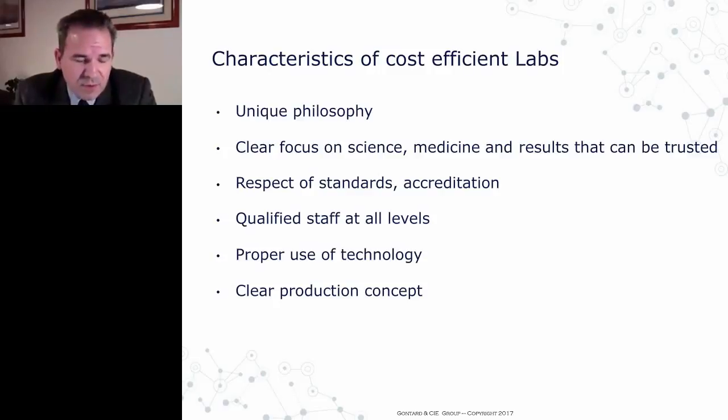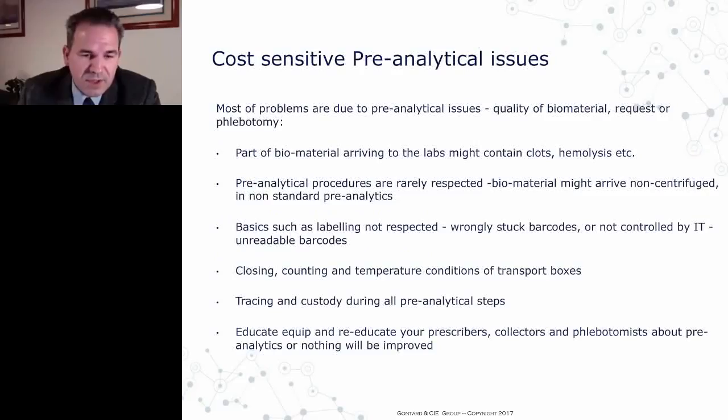That enables us to move samples between production sites and to reduce the number of machines deployed, and we use one site as a redundancy for the other one instead of having 2 or 3 times the machines on location, to enable us to have a non-break of production in case something happens to one of the machines.